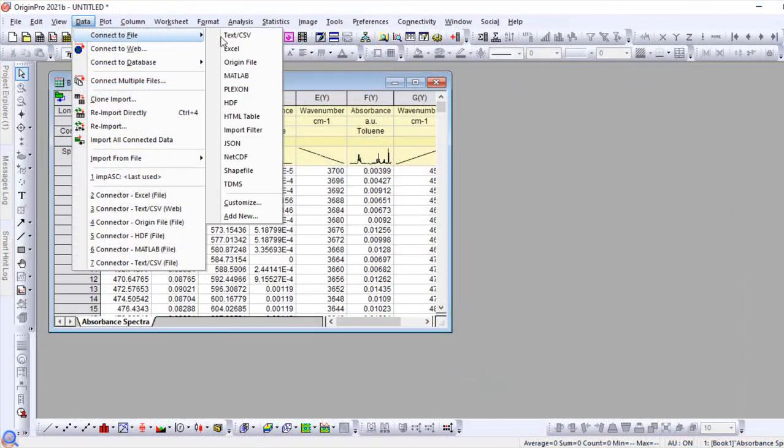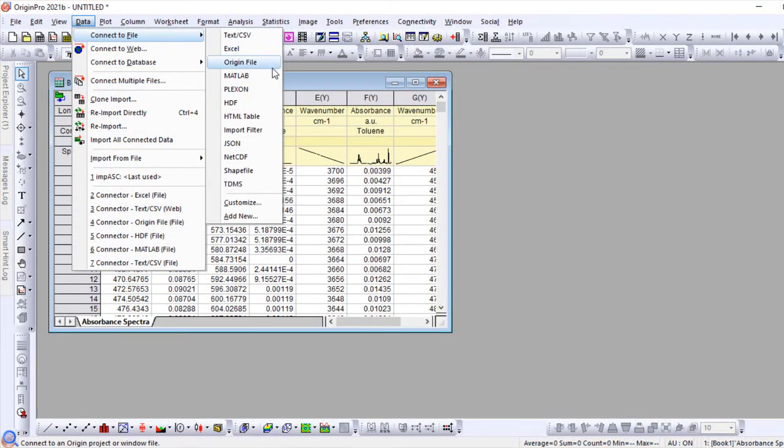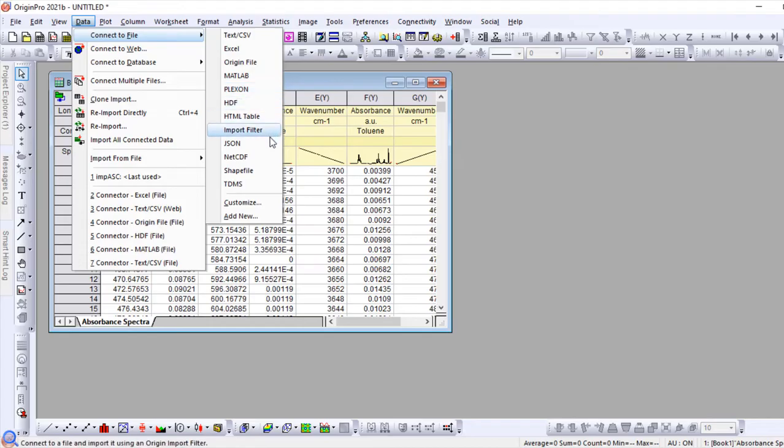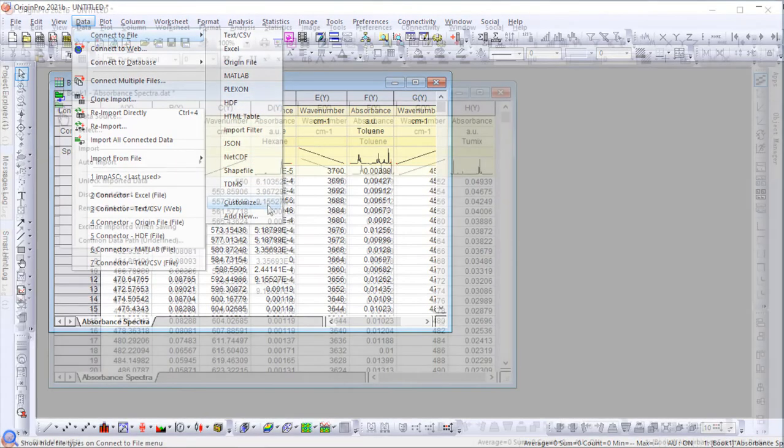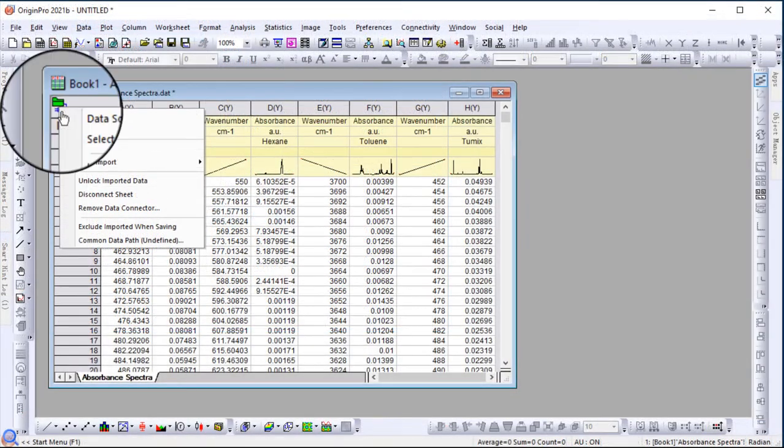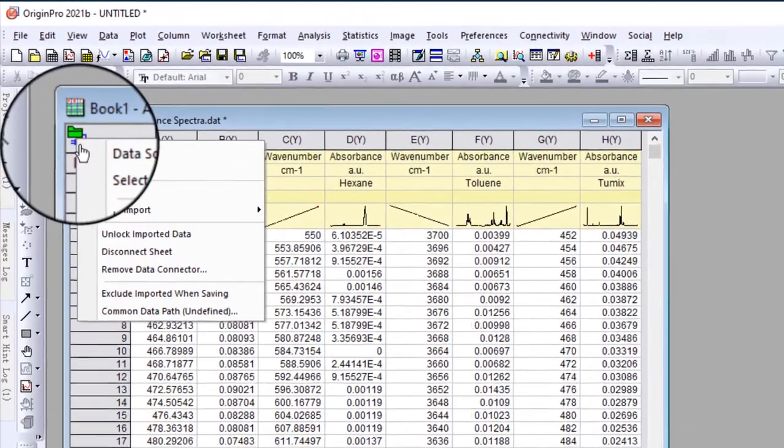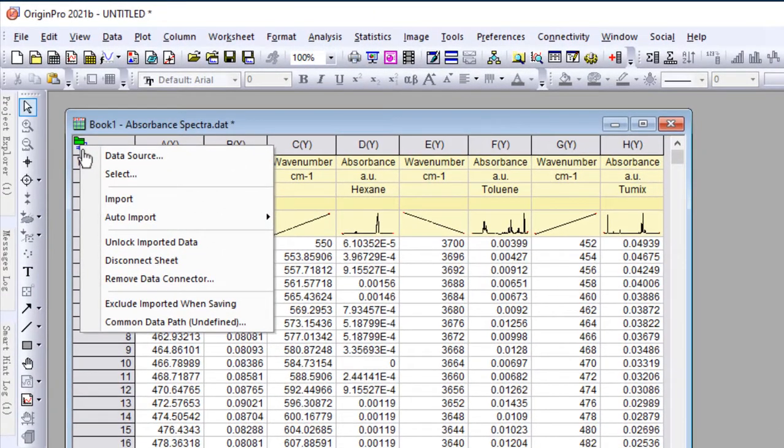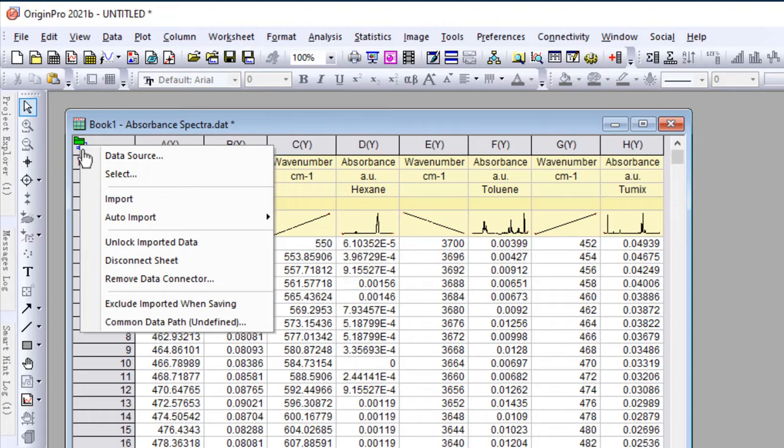Origin provides data connectors for a wide variety of file formats. Your worksheet stays connected to the data file. The data connector icon provides a menu with several options including easy re-importing of data when the external file is updated.